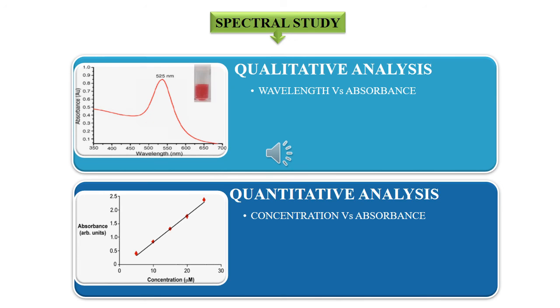So what is the quantitative analysis parameter? Concentration versus absorbance, concentration on the x-axis, absorbance on the y-axis. Through the calibration curve we can find the sample concentration.